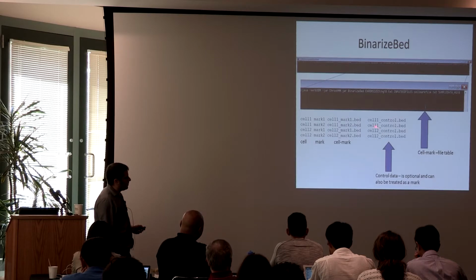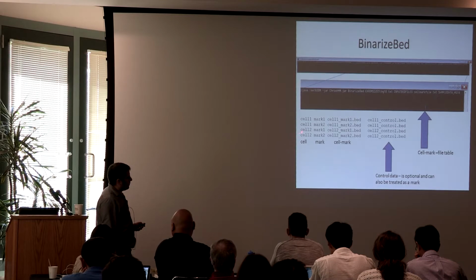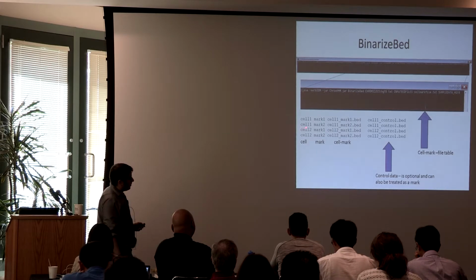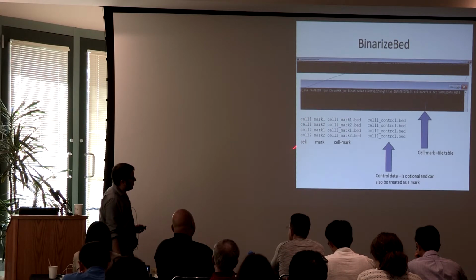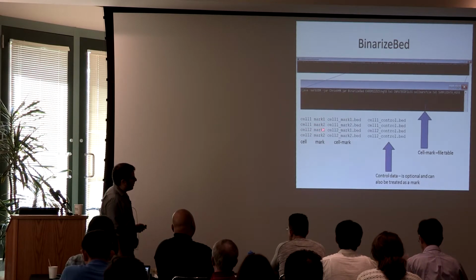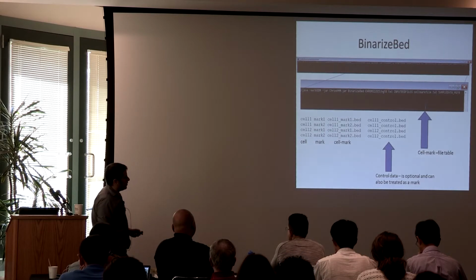But it would need to be sequenced reasonably deep to serve as a control. And so in this case, when you have multiple cell types, what it's going to do is learn a common set of chromatin state models, but then learn cell type specific annotations. If you wanted to have multiple cell types, but you just wanted to have one annotation in the genome, you would just give it some common set of cell names and then name the different marks specifying the cell type. And then you could learn sort of a stacked model of all your data at once.